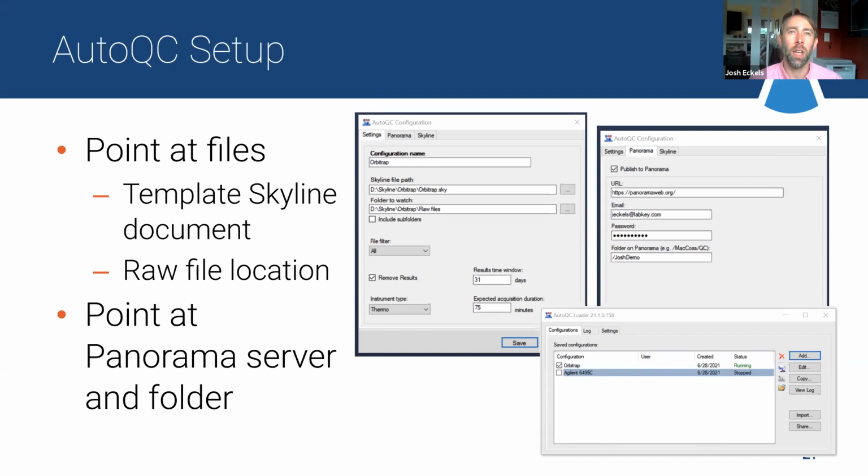And I think we've got one built-in one, which is essentially precursor area versus transition area. I mentioned the ratio between those as being one of the metrics, but we've got a pre-configured option to see those as two separate series on the same plot. So I think that's definitely a nice future step here: what are good ways to compose these individual metrics together, to give us a little more of a summary view of the highest importance.